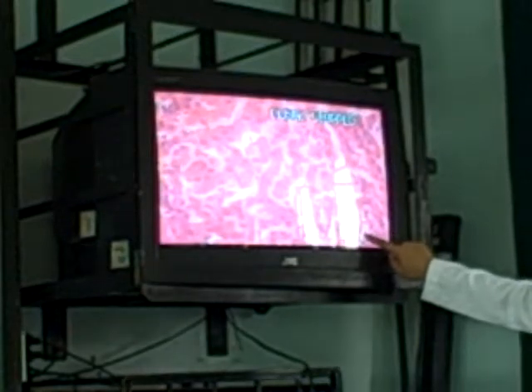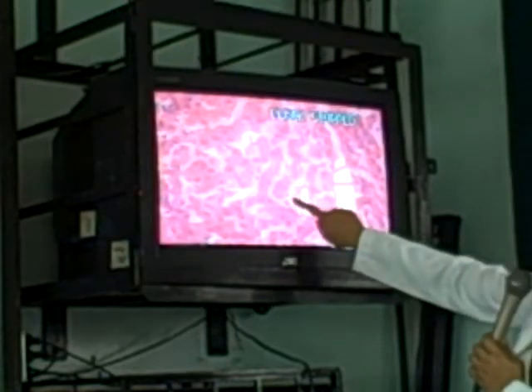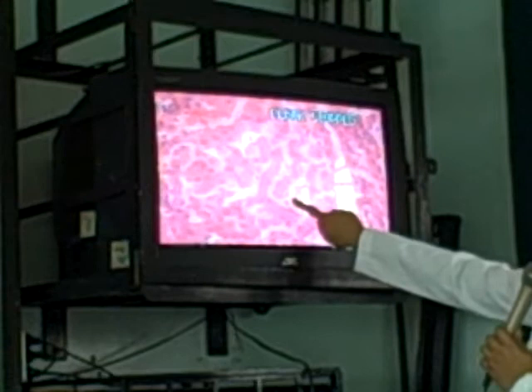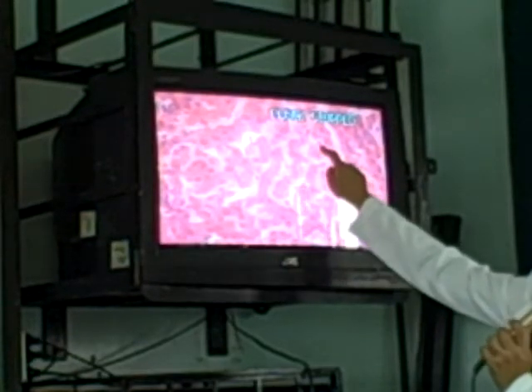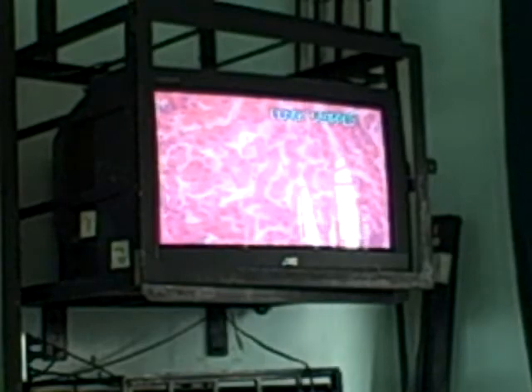Okay, these are the nucleus. This is the nucleus of one Kupffer cell. Not this one, probably this one, but this one is also the nucleus of one Kupffer cell. Now, going back to the basics, your hepatocyte is polygonal in shape, mononucleated, or you also have two nuclei in one cell. What else? Acidophilic cytoplasm, etc. So you have to go back to the basics.